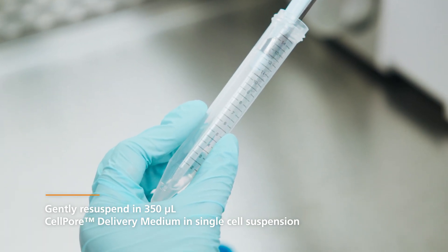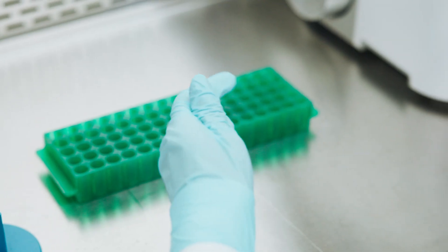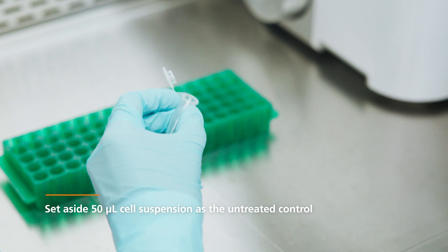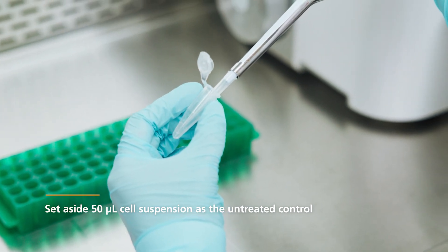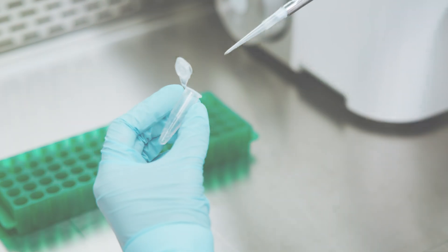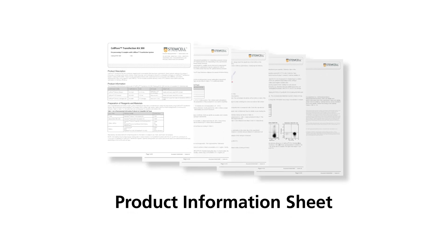Confirm the input cell number by performing a cell count. Adjust if necessary. Set aside a 50 µL aliquot of T-cells as an untreated control. This represents 2 million cells. Refer to the product information sheet for more detailed information, including a list of recommended EZSEP isolation kits for ready-to-use cells, and additional notes and tips to consider when preparing your cells.